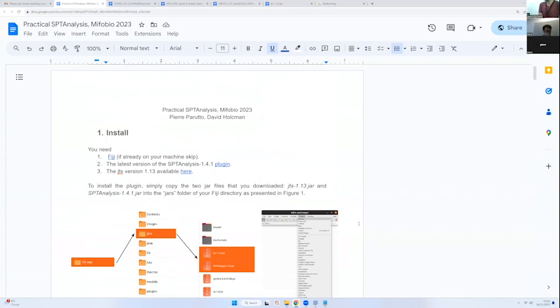Okay. Yeah, sure, try it. But it works only mostly for surface proteins. And also for the ER, which is luminal. Yeah, for everything in membrane and cytosolic, the lumen. Now, if it's 3D, then you have to have a way to get the 3D, but we haven't implemented that here.